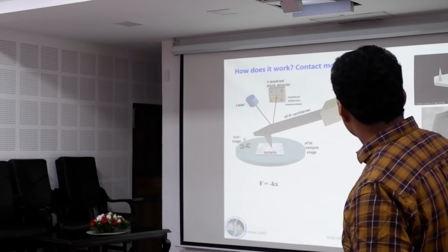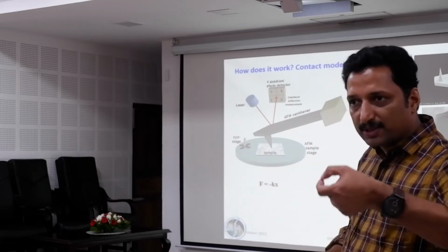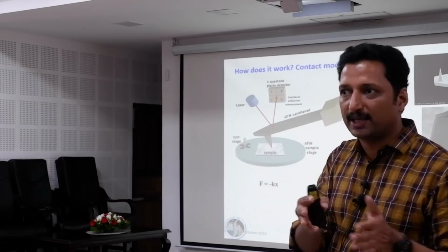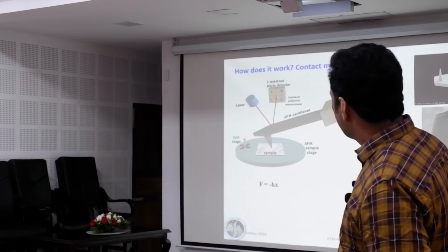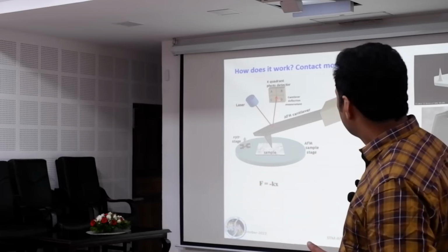Okay, cantilever. So this is our normal cantilever. We can actually take a cantilever using a tweezer and put it there. You will get a set of cantilevers with the AFM. You can buy it again. And then the first thing is actually to nullify this, to make it 0, the difference between any of these things.